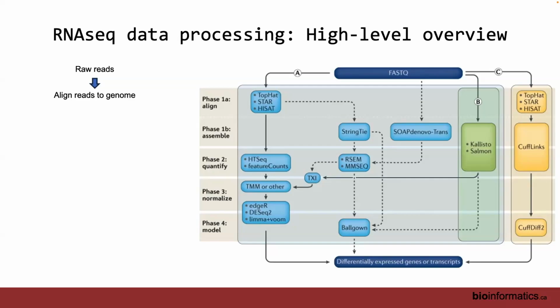But the bottom line is that, practically speaking, there's this workflow. It starts with reads, no matter what. Even if you get single cell data, it's just reads. And at some point, you need to align it to the genome, and it has to be the right aligner for the data type you're using. So for RNA-seq, it's got to be splice aware, right? For DNA, it need not be.